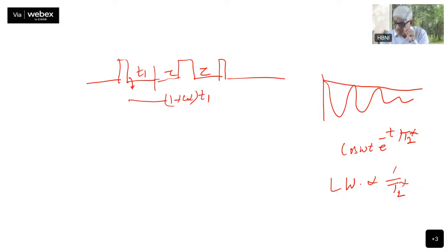This is T2 star. T2 star includes the normal T2 relaxation plus the contribution due to the inhomogeneities in your system. Now, where are the inhomogeneities coming in this sequence? You see there are two components of the pulse sequence here. During the t1 period, the full T2 star is operational.